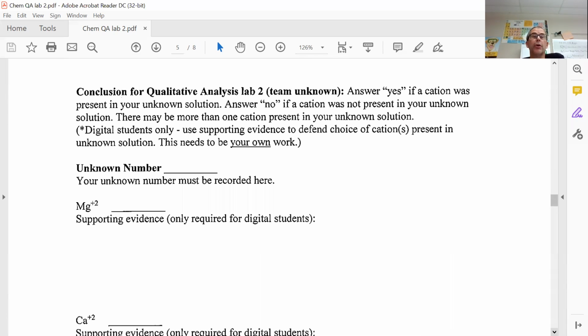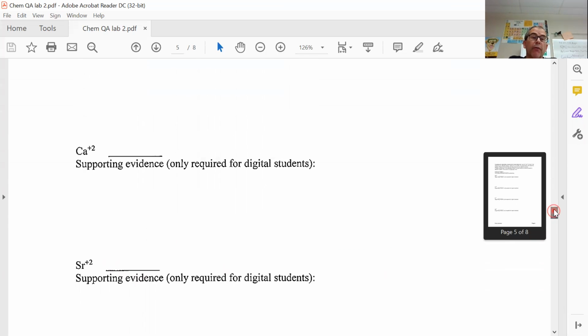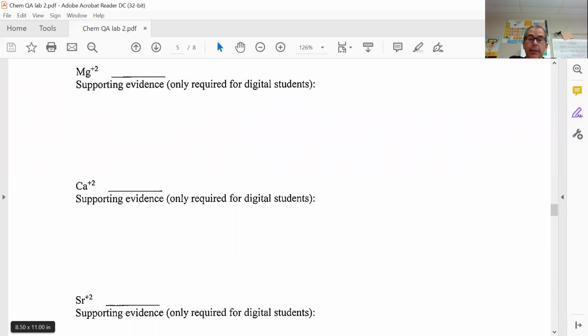As far as the unknown, make sure you're putting your unknown number, or if you're in the online group, which if you're watching this you are doing an online video, it's going to be the correct letter: A, B, C, D, E, and maybe an F. I'm not sure how many I'll have in there. And make sure to do that. Then you're going to be answering yes or no for magnesium, calcium, strontium, and barium. One hint here is make sure that the order of these ions here does not exactly match the order on the flow chart. So make sure you're following the flow chart and answer these questions in the order that you're figuring those out in the flow chart.